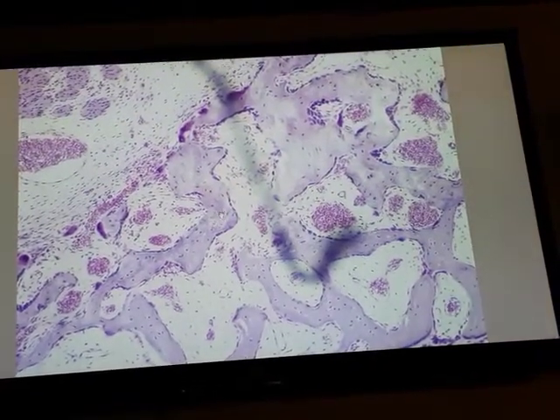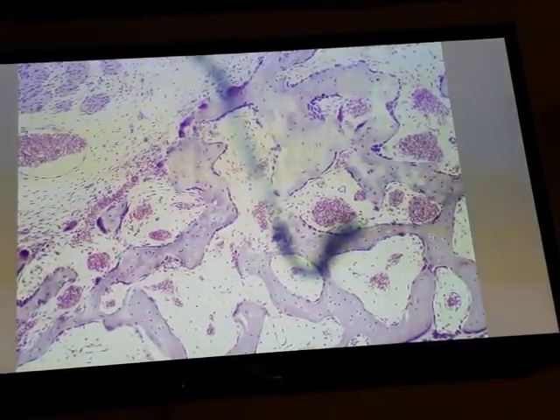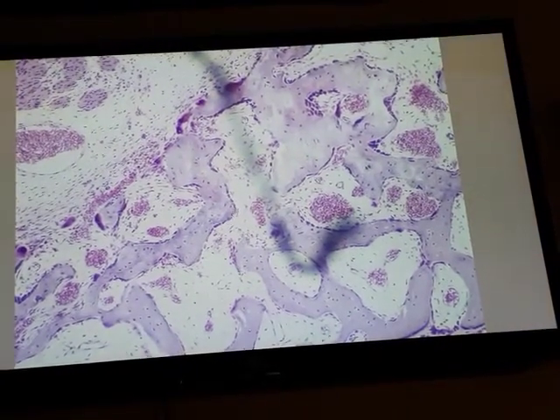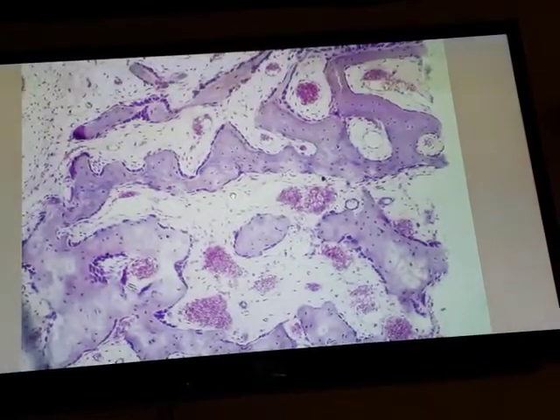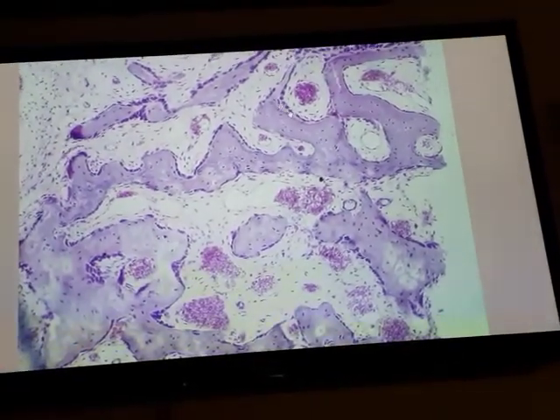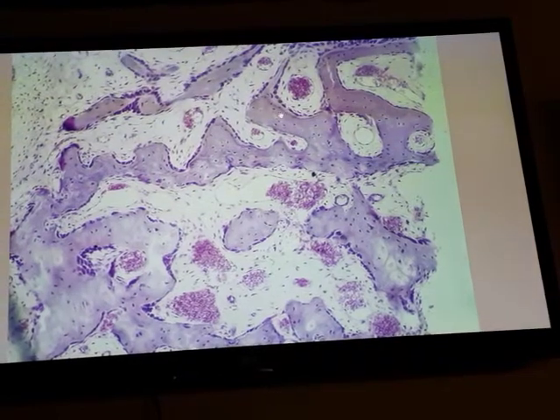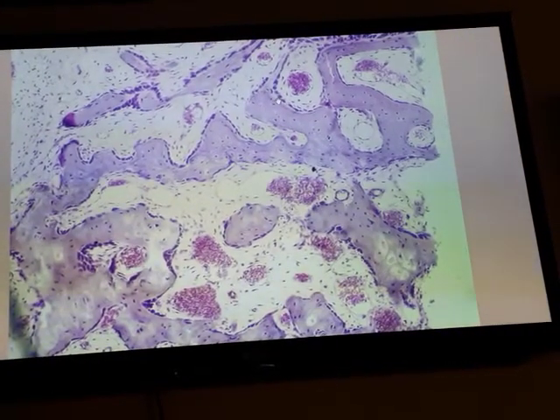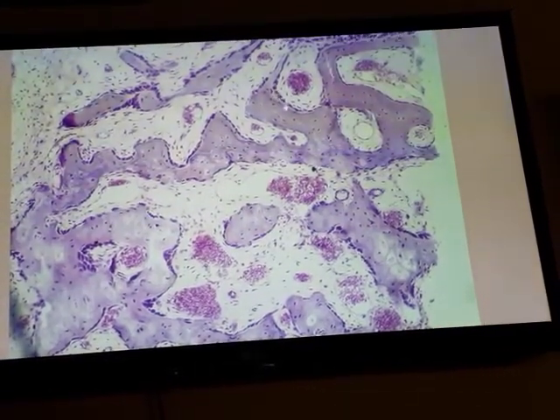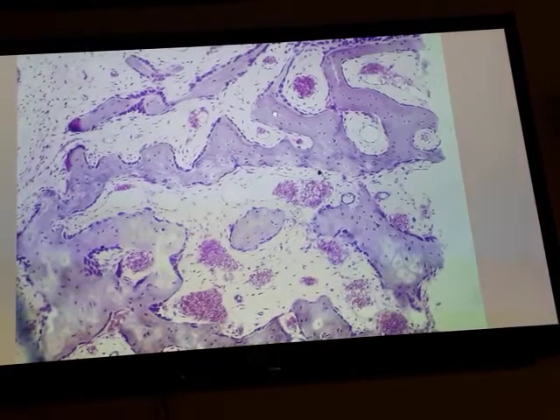In the center, we have calcified matrix. Within the matrix, we have osteocytes. At the surface, we have osteoblasts. The layer located between the osteoblast cell layer and the previously formed matrix is called osteoid. Osteoid is non-calcified matrix, found between the osteoblast layer and the previously formed matrix.